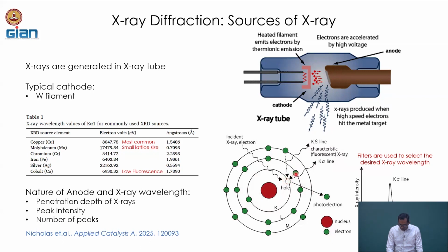So, if we look at the atomic arrangement, when the X-rays are generated, photoelectrons are emitted, and electrons from a higher shell fill the hole that is created at the core shell. If it is coming from the next electronic shell, it is called a K alpha line, because these electronic shells are at a lower energy. Then when they come they emit energy, and if the electron is at an even higher energy, when it comes it emits even more energy. These are the X-rays that are radiated from the sample. If it comes from the next-to-next neighbor, it's called the K beta line.